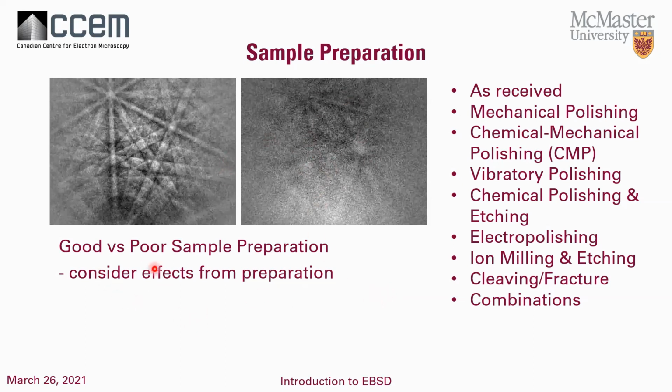So has it produced oxides? Have you got contamination from the preparation, like colloidal silica, that sort of thing? So you have to keep those things in mind when you're doing preparation.